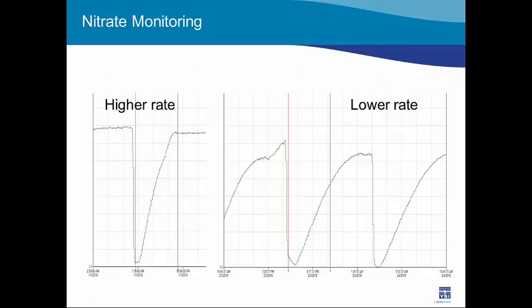And so to show you a couple of figures from that application that the customer shared with us, we have a couple of different conditions. At high rate nitrification, if the green line is the online nitrate, they would expect that once the batch started, the nitrate would increase swiftly until it plateaued. Basically, all the ammonia was oxidized. And this is an example of a high rate, measured by the nitrate.